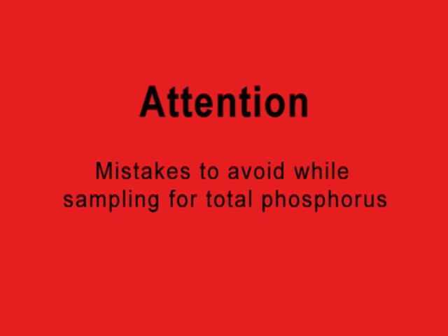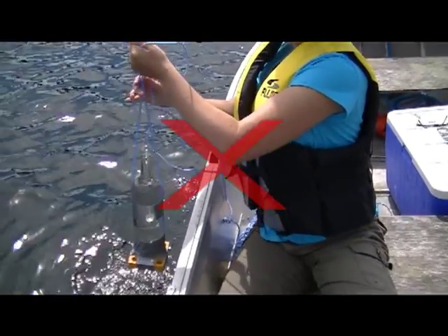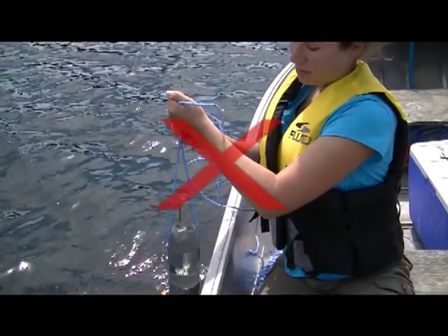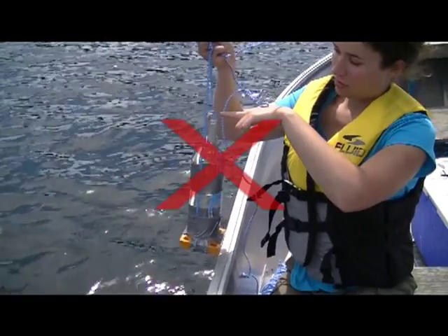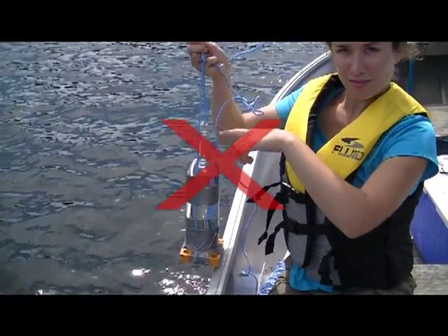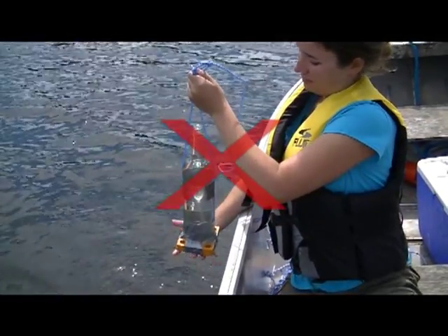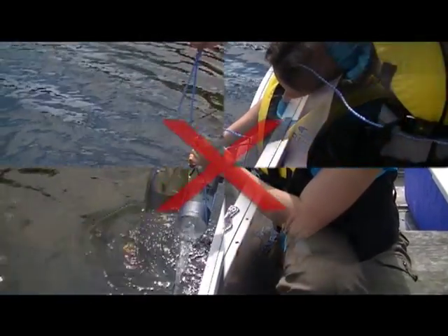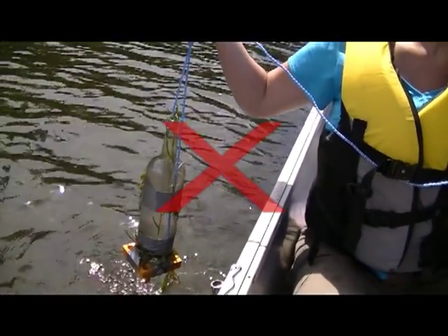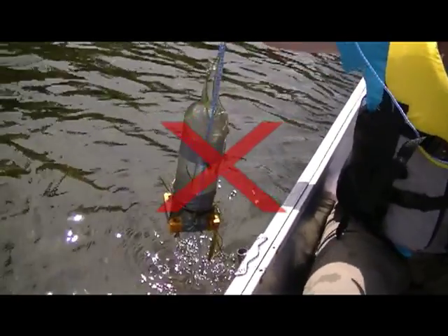Attention — please be careful to avoid the following mistakes when carrying out your total phosphorus testing. If your sampling bottle has not filled up entirely by the time it reaches the surface after you have sent it all the way down and all the way back up, representing all levels of the lake water in the euphotic zone, either try using a bottle with a smaller neck or add more weights to the bottle so that it descends faster. When taking your samples, be sure to avoid getting disturbed sediment from the bottom of the lake or vegetation from aquatic plants in your sample, even when the lake is shallow or carpeted in aquatic plant life.